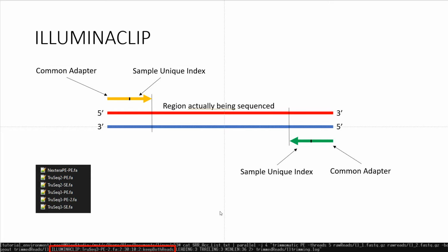Or we could throw away too many, since we have 4 output files. If they're going into one of the unpaired files, we could end up with a higher unpaired count than is actually not paired. So that's really important. There are ways to go around it, but the end goal of this project is to make a workflow where you can just feed in your raw reads and it does everything. And with Snakemake, it's way easier if we just keep both reads, because then we can say all of them have a forward and reverse when we start mapping against the genome.